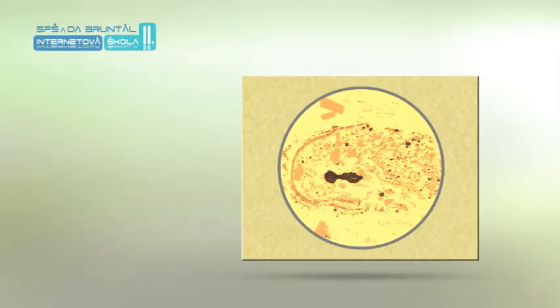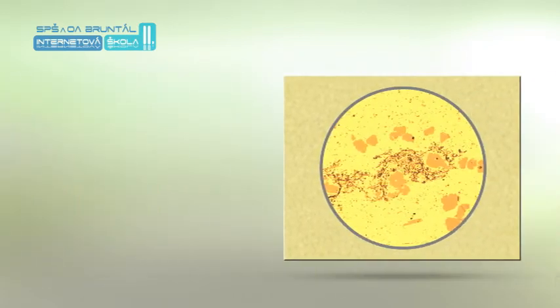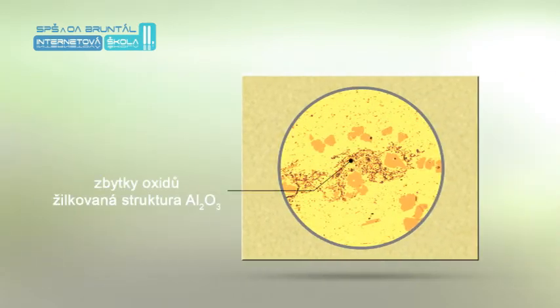In this image we see oxide inclusions, which are foreign particles insoluble in aluminum. The presence of these inclusions in the material is mainly related to non-compliance with technological conditions, for example poor alloying procedure, overheating of the melt and similar.